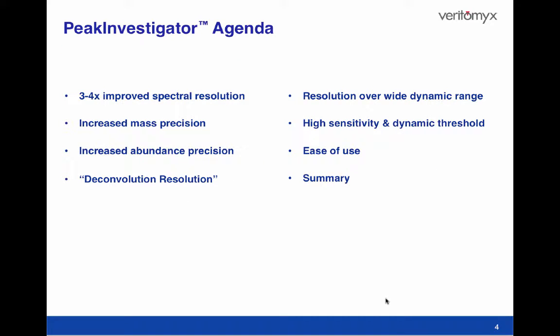This presentation will show PeakInvestigator's superior resolution and precision. It illustrates how PeakInvestigator is remarkably robust and easy to use. Most importantly, it will highlight how the improved resolution and precision can accelerate your compositional identifications and lower your R&D costs.